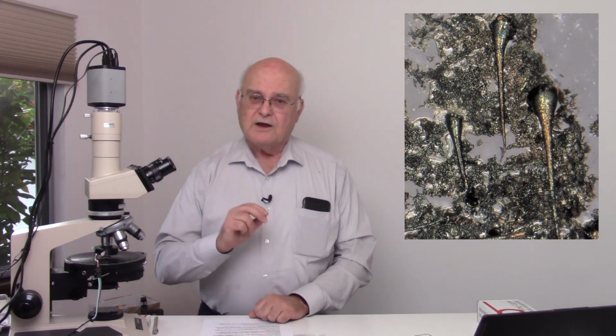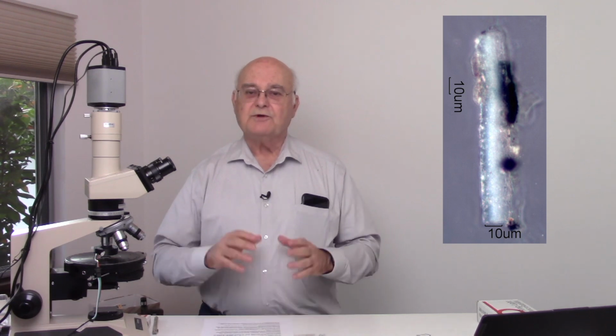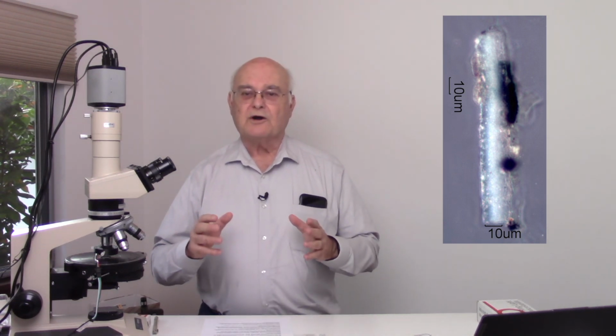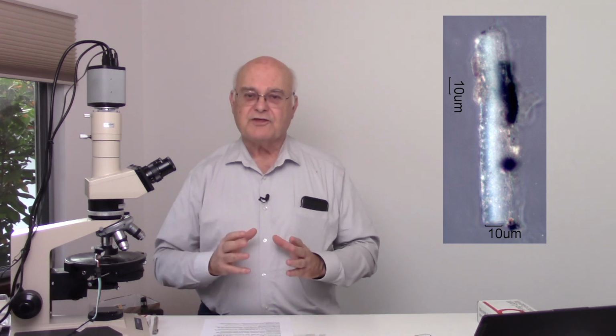If the fire got hot enough for long enough, all of the carbon is gone. But as I mentioned, the silica phytoliths often have water of hydration mixed in with their structure. As a result, when they reach a high temperature, the water begins to come out, and it makes the particle look frothy.